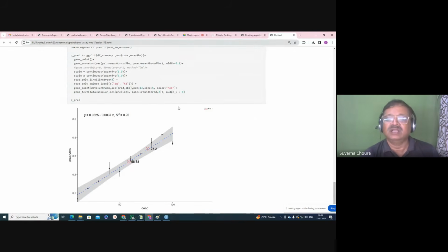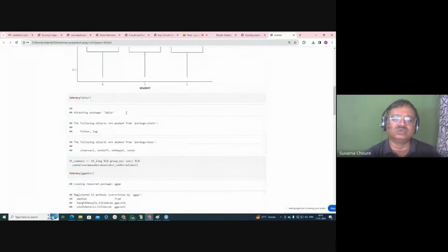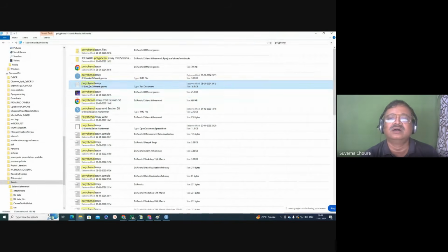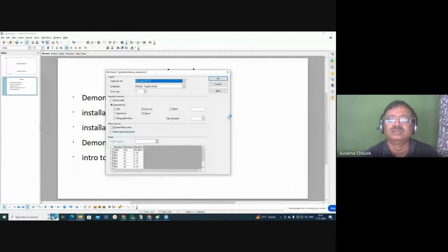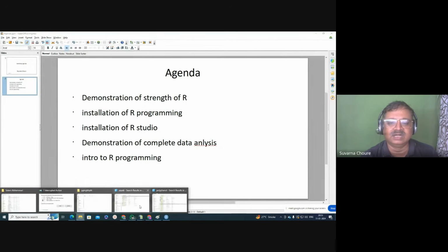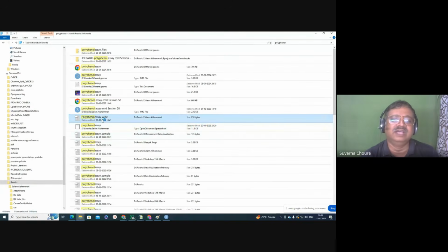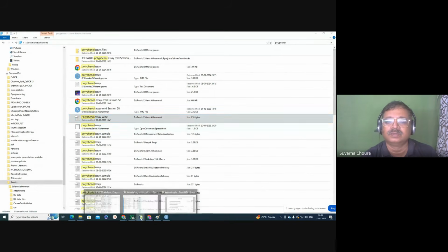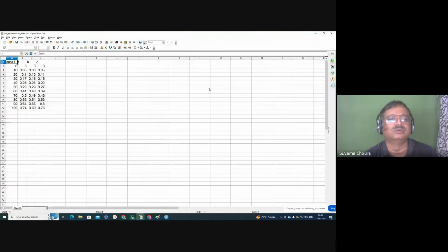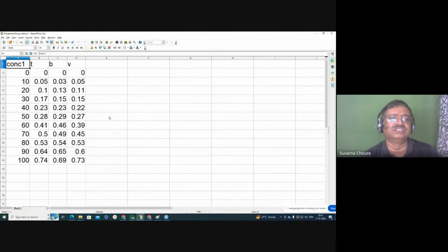And that's it. Our own data also we can use, and this data, my students use this data, and this data will be somewhere here, polyphenol assay. This is not, this is the data which my students created. This is also not the complete data, polyphenol assay wide, and here actual readings are there. That's not opening here, that's opening. And these are the readings by Tanvi, Bhagyashree, and Vaishnavi. These readings I plotted.